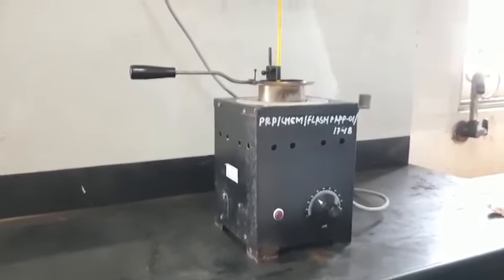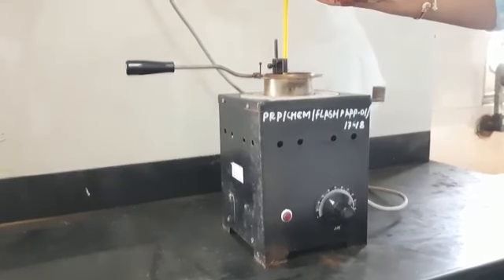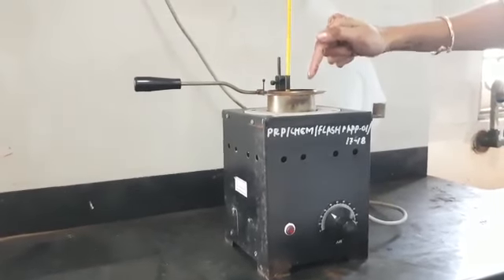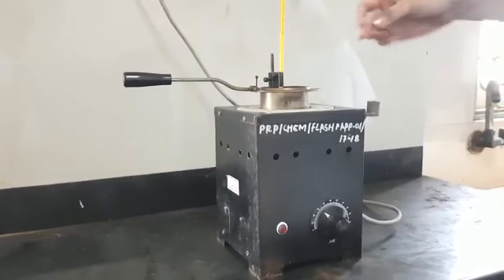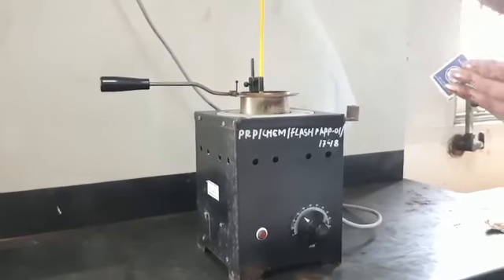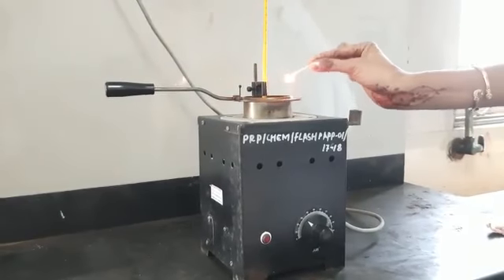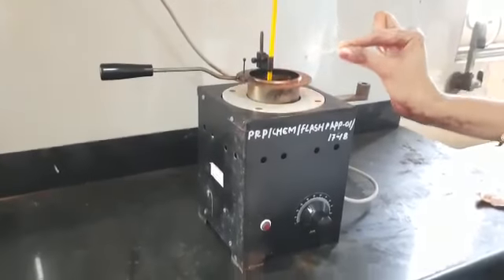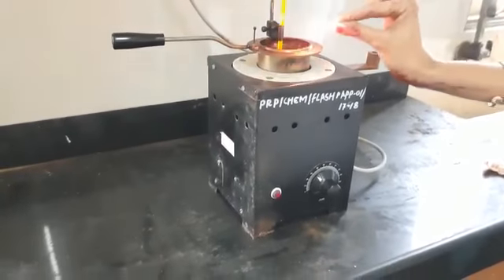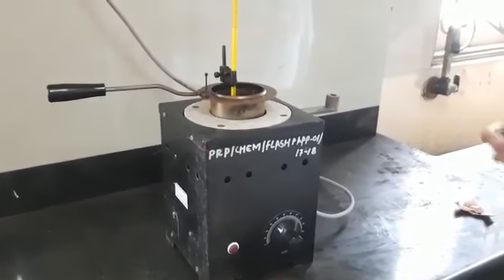This instrument is called a flash point and fire point apparatus. In this we put diesel. We are going to check the flash point of this diesel. Okay, we are putting a flame on the surface. We will check whether it catches fire or flash. No catch. So at 30 degrees Celsius it is not catching a flash or fire because there are not sufficient vapors to catch fire.